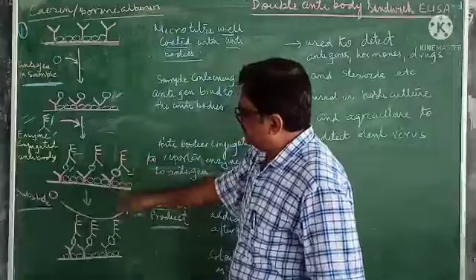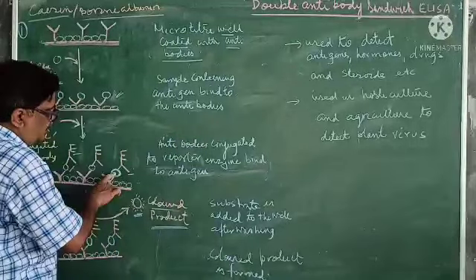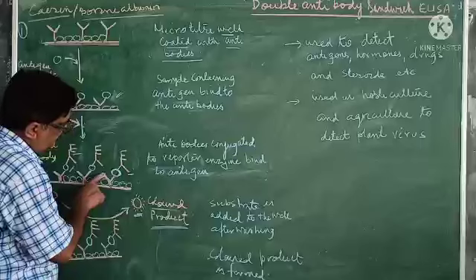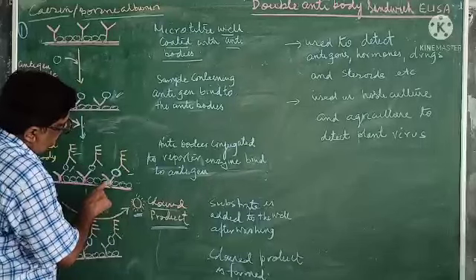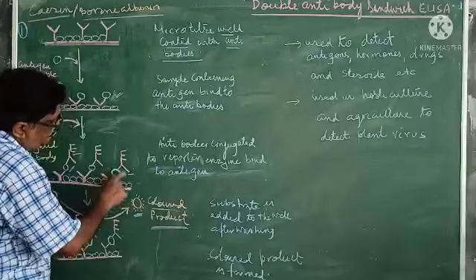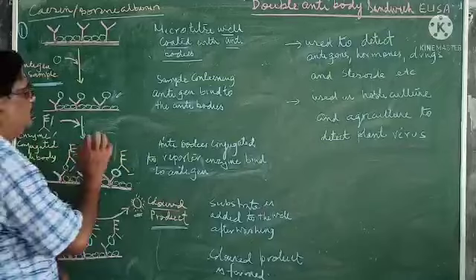This is the process. The antibody on the surface is responsible for binding the antigen and keeping it in the well.